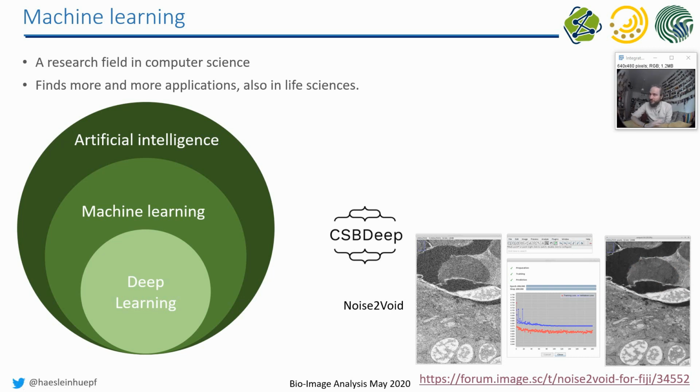So not for every application, for any kind of image coming from any kind of microscope, Noise2Void might be the right way. That's why I'm again saying, this is still part of active research, and which deep learning based algorithm can be applied to which image to get what out is still part of research.